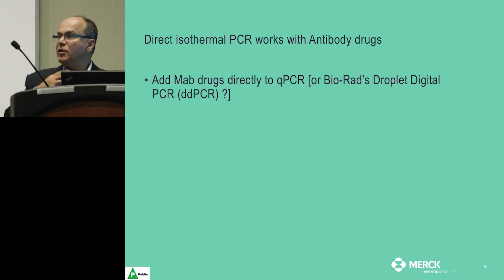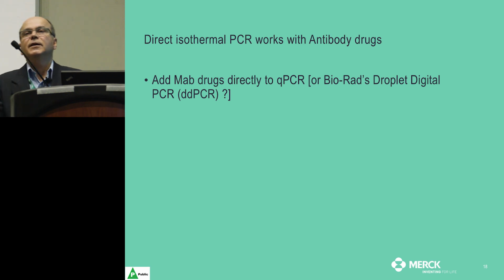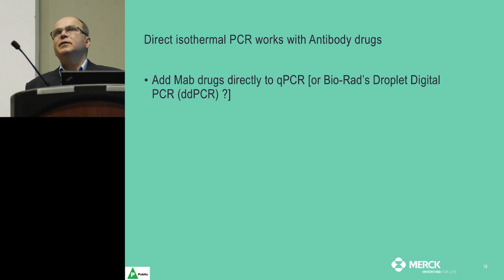We have solved the CHO monoclonal antibody testing by adding protease and digesting the protein. But what the protease does is, if we subject it to thermocycling, it precipitates.